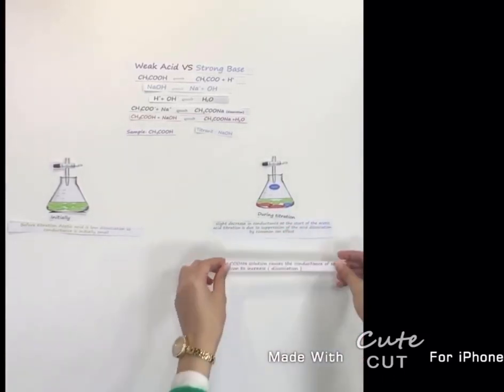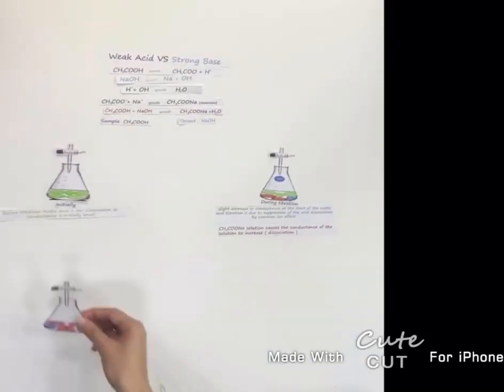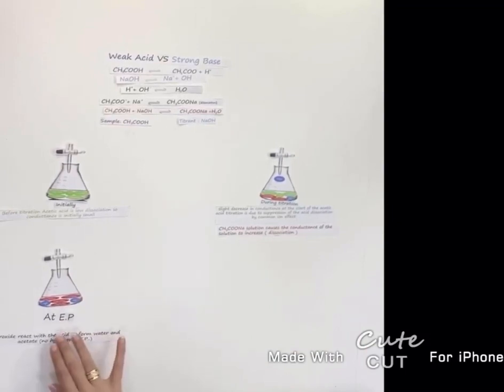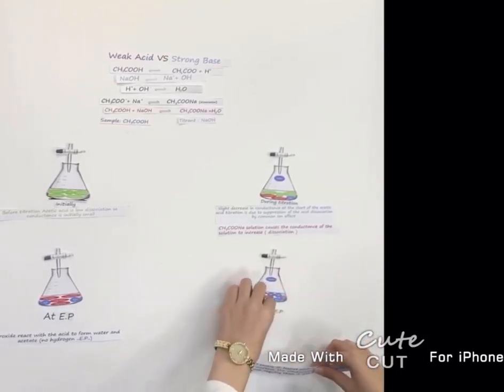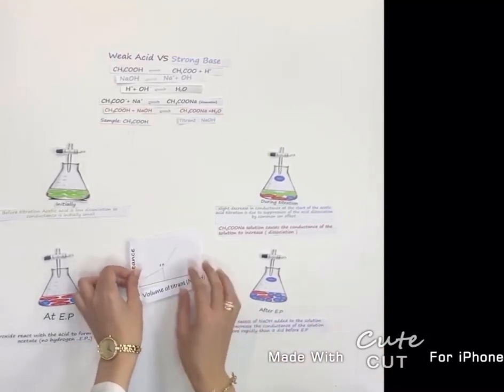Then sodium acetate solution causes the conductance to increase. At the endpoint, hydroxide reacts with acid to form water and acetate. After the endpoint, excess sodium hydroxide is added to the solution, and this increases the conductance of the solution more rapidly. And this is the curve of the reaction.